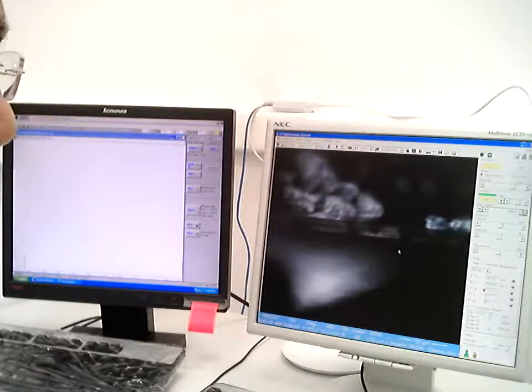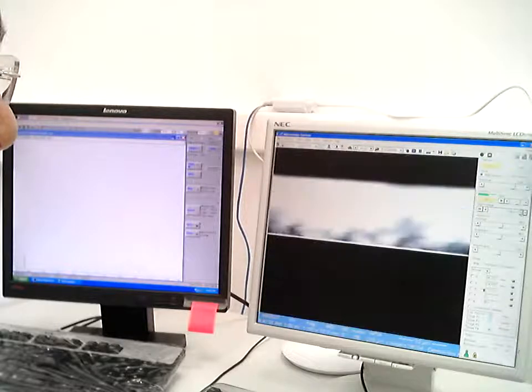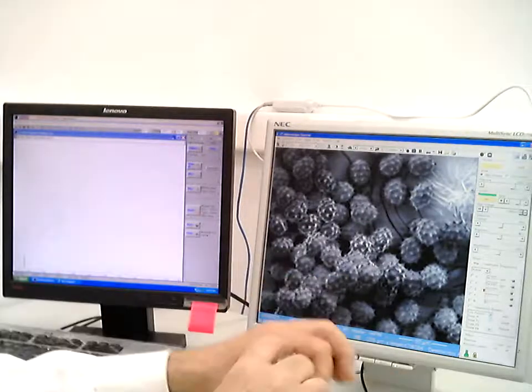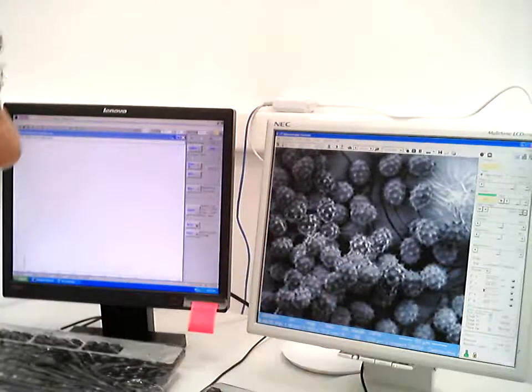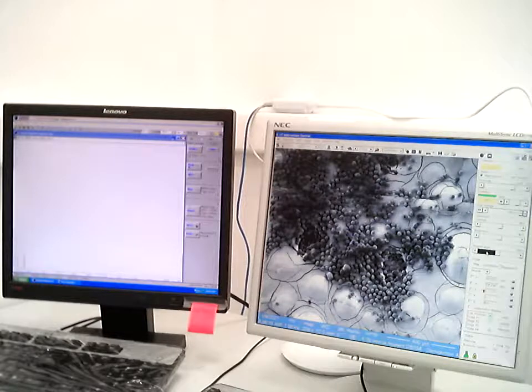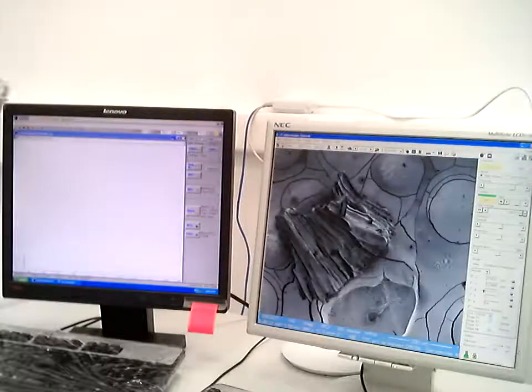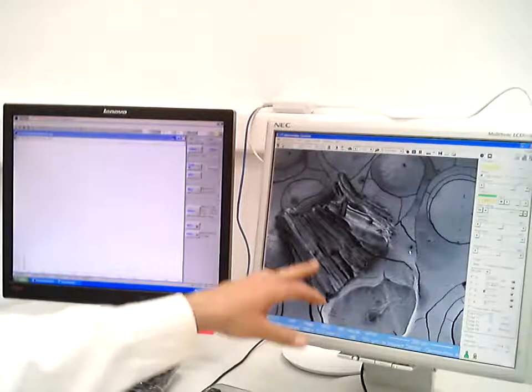So you can actually identify what flower was nearby when somebody was walking along or moving along, because this could have been taken from a shoe. And you can see the pollen is actually spherical with some spikes on it, and most pollen have a different shape according to the flower they come from. So this is again a very interesting type of forensic investigation, because it tells you a lot of where the person has been and things like that. Together with the pollen, we see some tiny particles of wood, and again, this can be analyzed, and we can find out what kind of wood this is from, and things like that.